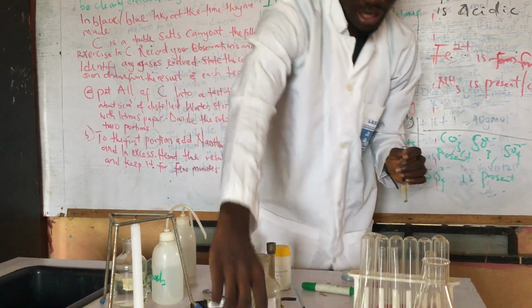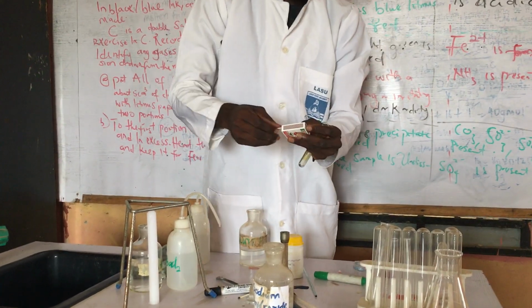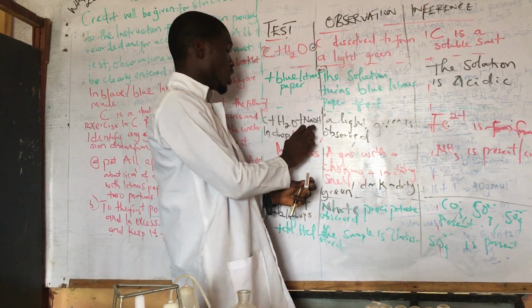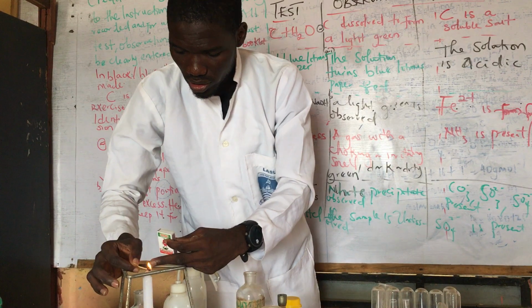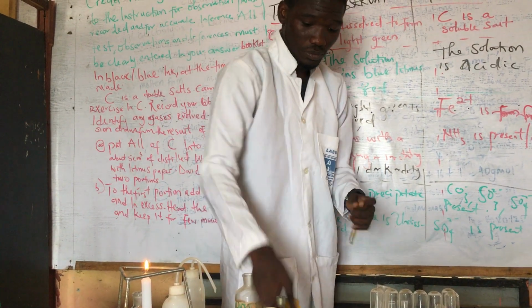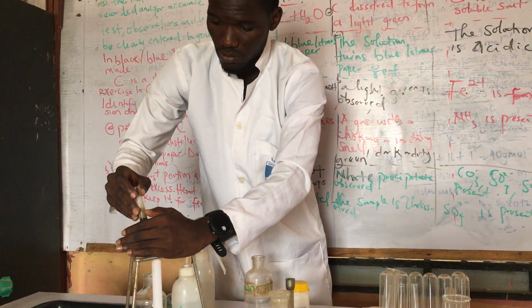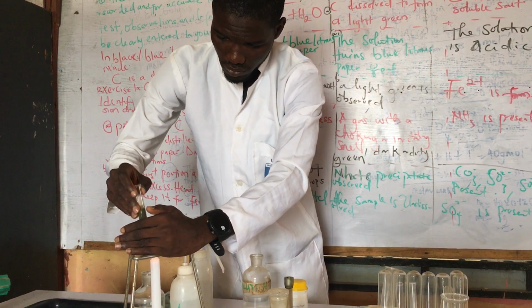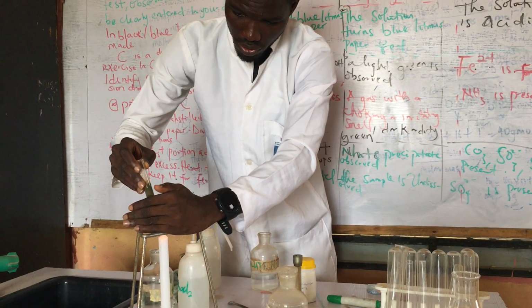Let me light it, I missed it the other time, so I have to go back to it to tell you guys the effect of it on sample C plus water plus sodium hydroxide in excess. So I have to light this.